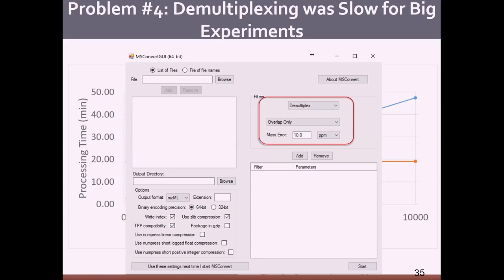And I'll just add, so yeah, you then end up with a file that looks like it. I mean, you can run Comet on it. It looks like it has no multiplexing at all, and you definitely should avoid then bringing that into Skyline with demultiplexing, because there's still the old settings, as we're going to just rip these out, or we're going to actually change them to use this code. But at this point, if you were to say, "Oh, demultiplex my data," you don't have a multiplexed data file anymore. So, yeah, and we've had some discussions about whether or not this could be done on the fly on some instruments. So you basically just then write a demultiplexed file. That's currently not possible, but that's something that we've been thinking about, if that would be possible and what it would take to do it.